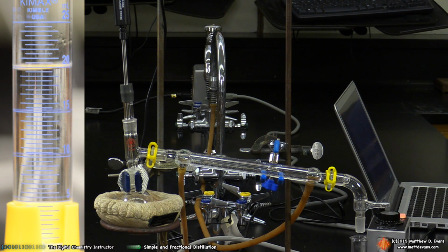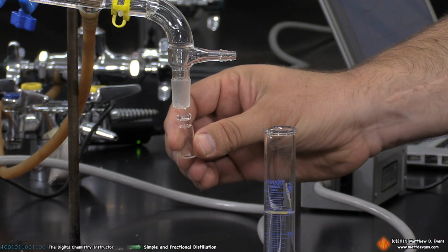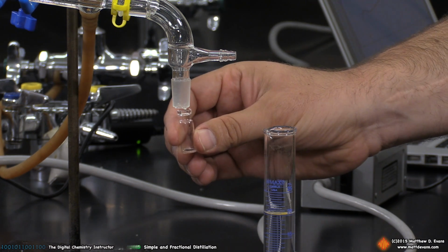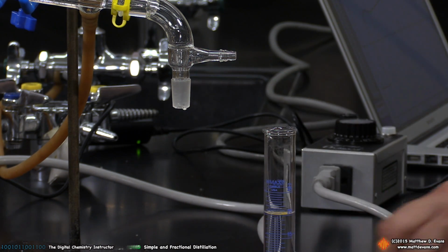Okay, I want to make a small correction in the procedure. I think earlier I mentioned that we're going to take a collection at 18 milliliters. The procedure actually calls for 20 milliliters, so we're now rapidly approaching the 20 milliliter mark. I'm going to go ahead and take another sample. Here's my second little GC vial, auto sampler vial. And once again, I'm going to look for about a third full. Okay, I've got approximately what I need.